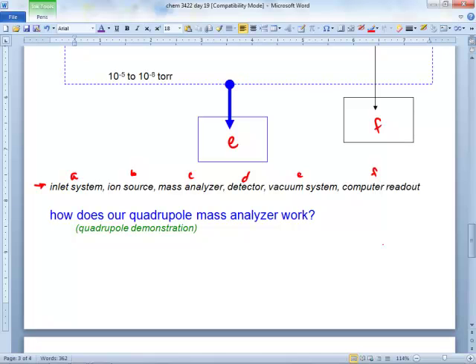Yeah. And this golf ball is actually pretty light. Well, he's heavier. Just use him. Okay. There you go. Oh, he's going to be really light. He's hardly going to take any energy at all, right? So does he go through then? Well, none of these are going to bounce. But the point is, he goes through. To get this to bounce through there, you have to apply a pretty nice energy, right? And that's what this thing is applying to it. If it doesn't make it through, it just gets sucked out, right? It's going to take a lot of energy to get that to bounce through there, and that's the only energy it's applying. So anything light is going to go flying out really early, and it gets sucked out, right? Make sense? All right, so good deal.